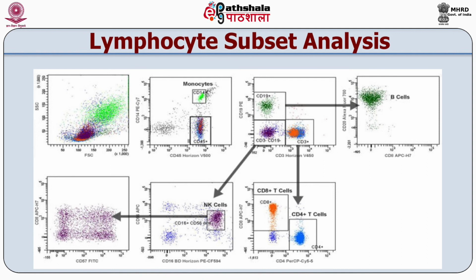This is an example of lymphocyte subset analysis in the peripheral blood. In this diagram, you can see that the CD45 antibody has been used to identify the leukocytes. Now further, the fluorochrome tagged CD3 antibody has been used to identify the T lymphocytes and the CD19 antibody to identify the B lymphocytes. The CD3 positive cells can further be divided into CD4 positive T helper cells and CD8 positive cytotoxic T cells.